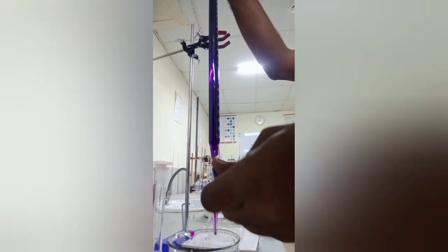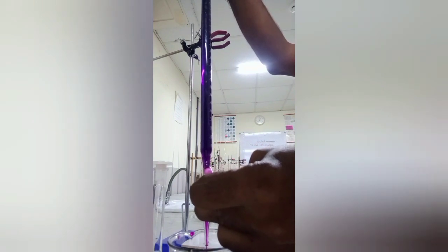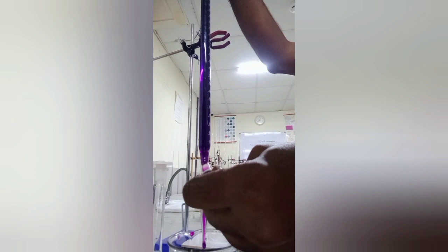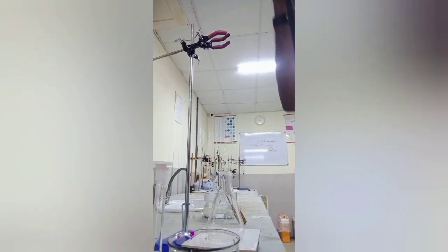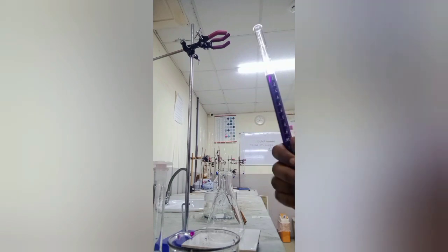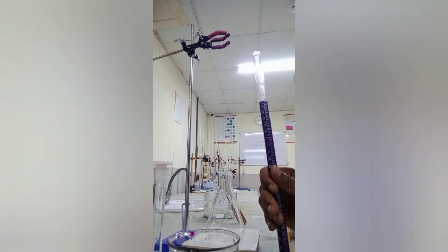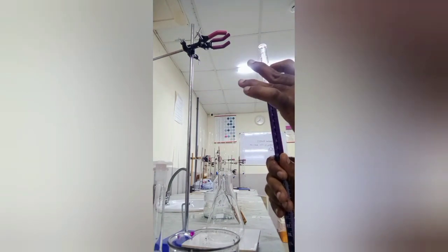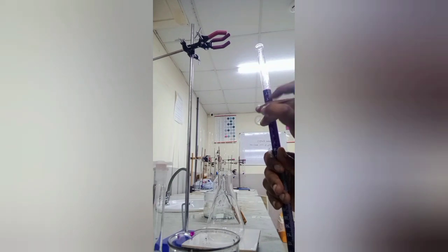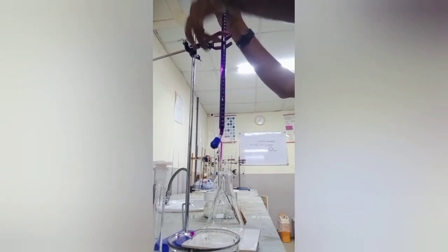Bring the excess solution to the 0 level. This is a colored solution, so you use the upper meniscus. Ensure that it is at 0. This is very important because a lot of students keep the solution elsewhere. Don't do that. You want to check the 0 level. Then fix it.